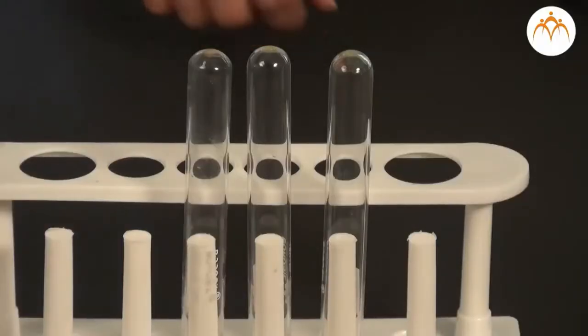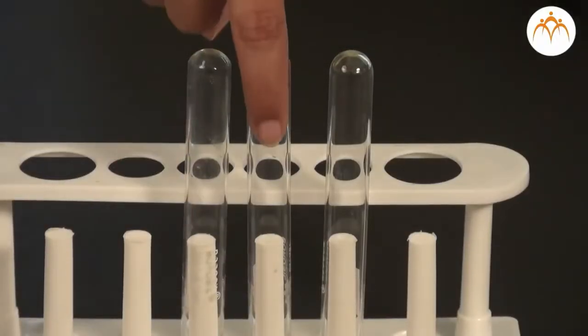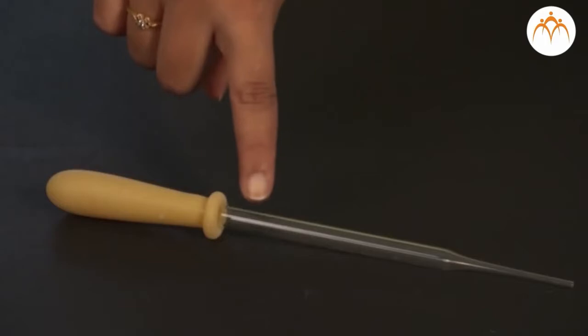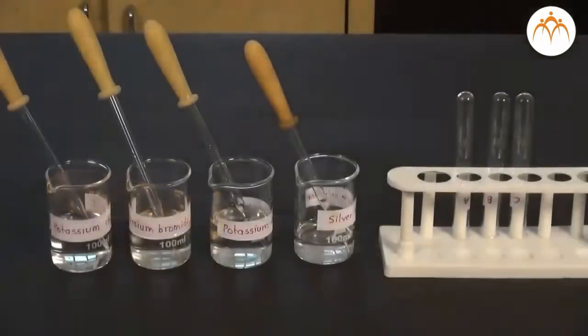We need apparatus like test tubes, stand, droppers, etc. We also need the compound silver nitrate. Three powders are given which look similar in nature. They are all white crystalline powders. They are powders of potassium chloride, potassium bromide and potassium iodide. For the experiment normally, we don't take them in powder form. We take their water solutions.